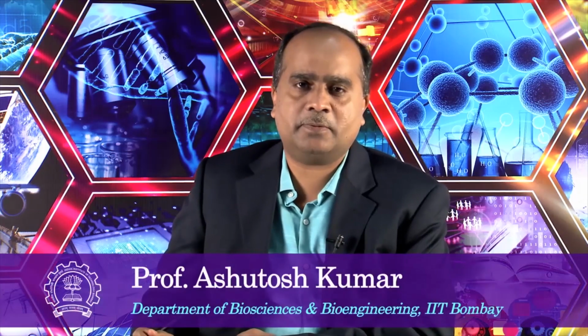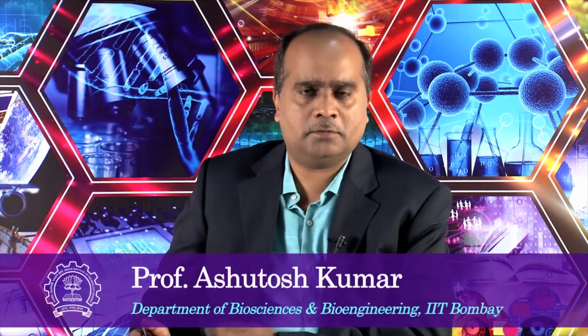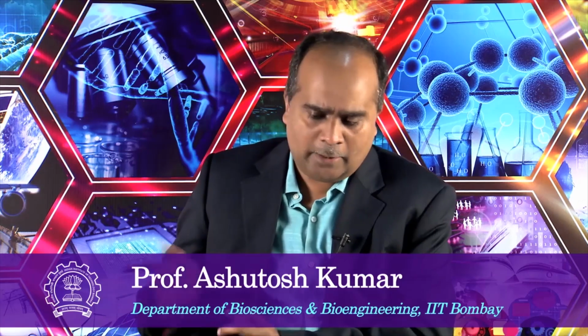Hello, and welcome to today's lecture. Today we are going to discuss the shape and size of a molecule, a macromolecule, and how NMR can be used to get some information about the shape and size of a molecule. The experiment is called DOSY, diffusion ordered spectroscopy.